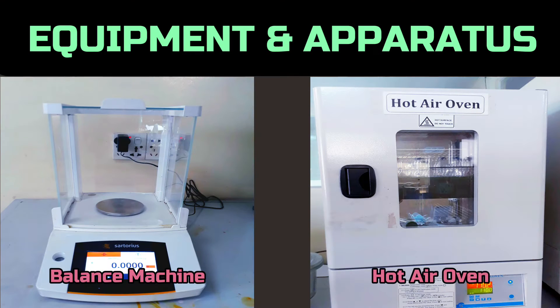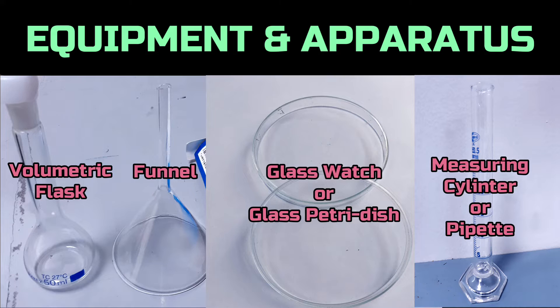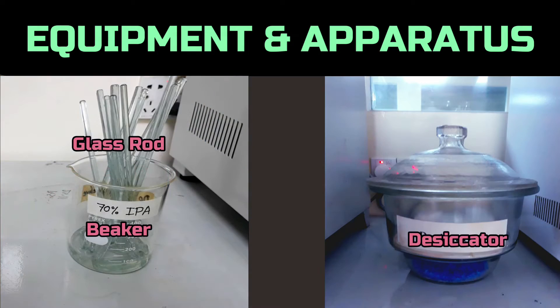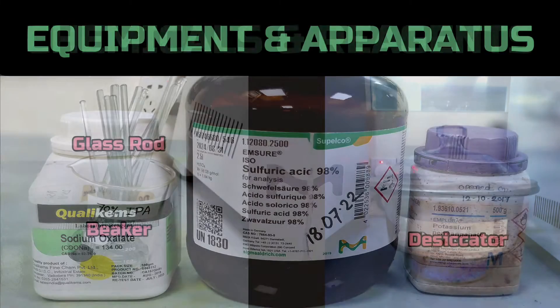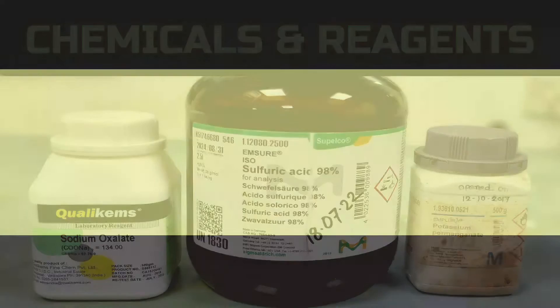For the preparation and standardization we need a balance, hot air oven, burette with stand, conical flask, volumetric flask, funnel, glass dish, measuring cylinder or pipette, glass rod, beaker, desiccator, sodium oxalate, sulfuric acid, and potassium permanganate.